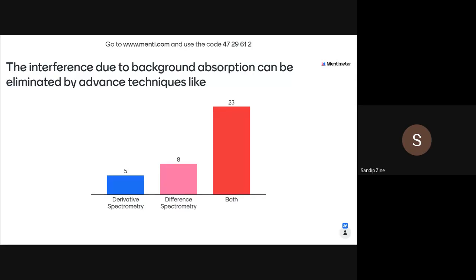That is a basic question I am asking over here in a chat box. So what parameters, or which particular pointer we will consider to record the UV spectra, when we are going for lambda max absorption of any compound, or to find out lambda max of a compound? What is the graphical output, what versus what? So I'm expecting your answer in chat box.